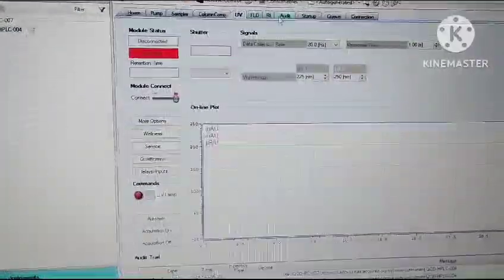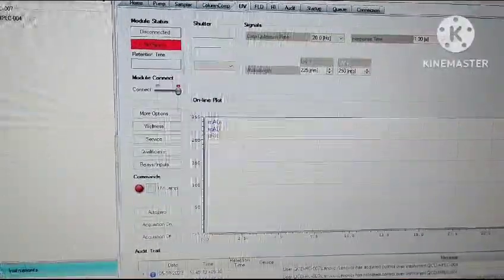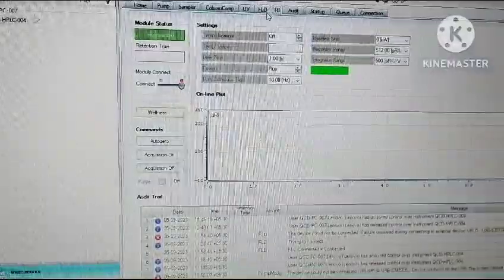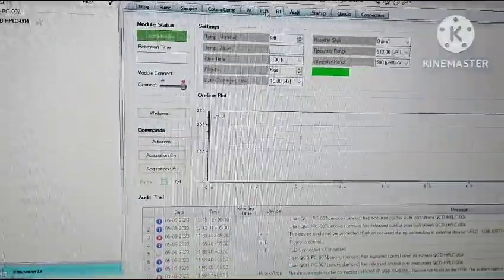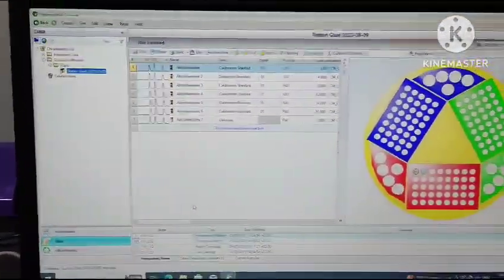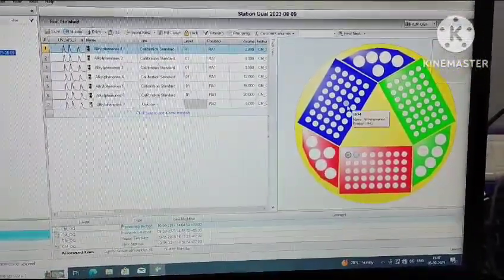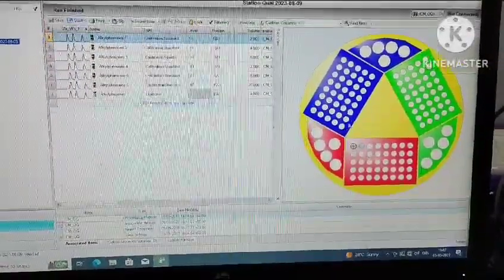These are the detector, UV detector, fluorescent detector, refractive index detector. Here we put the nanometers of the detectors. Here UV visible detectors are of 2 types, UV1 and UV2. These are our sample port. Here we put the sample and can easily recognize from here.